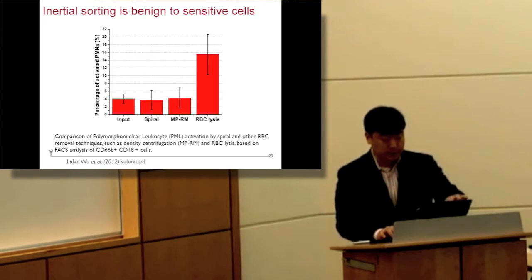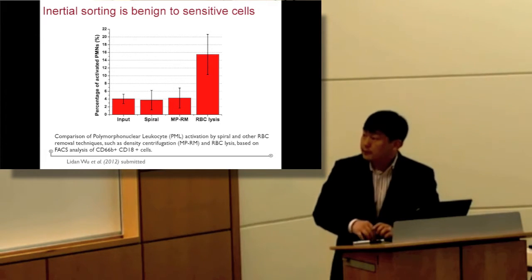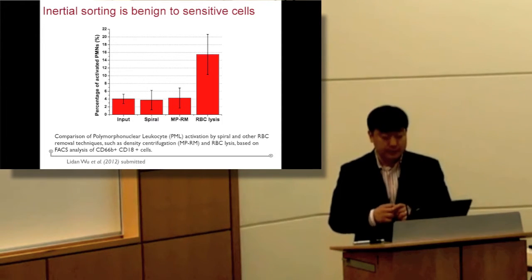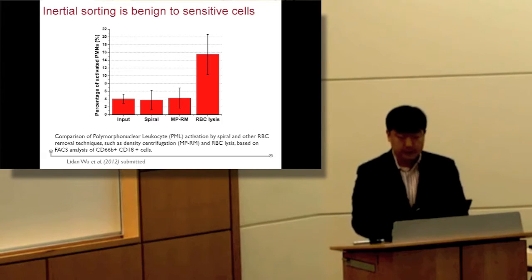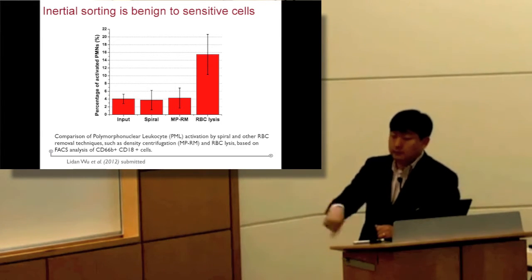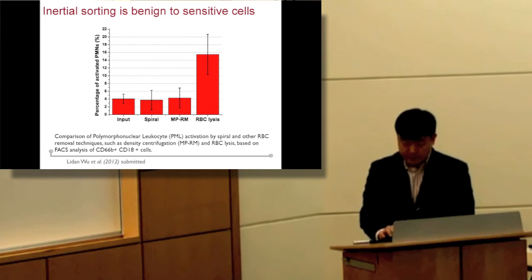And the last piece of information is that although this is a fast-flow microfluidic system, we have confirmed that it is very benign even to sensitive cells, such as neutrophils in this case, and we were able to culture the mesenchymal stem cells out of this spiral channel. So that's it for today's presentation. Thank you for listening.